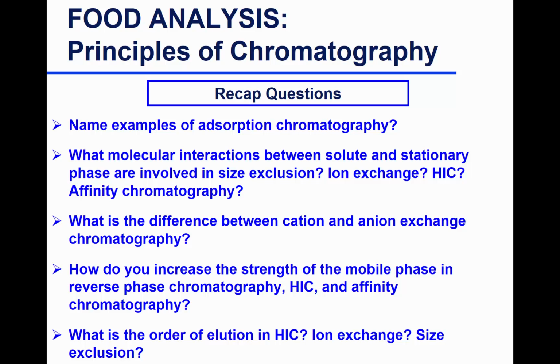Affinity? Yes, affinity chromatography is an adsorption chromatography. What else? Sven? Ion exchange? Do you have anything else? Size exclusion. Is it adsorptive chromatography?